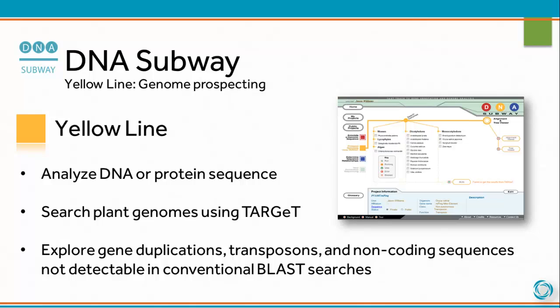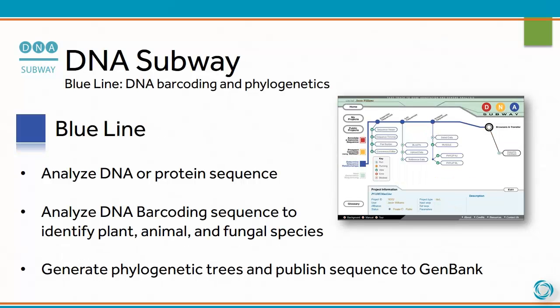The yellow line also covers non-coding sequences not detectable in conventional BLAST searches. The blue line is for DNA barcoding and phylogenetics. Use the blue line to analyze DNA or protein sequence, identify plant, animal, and fungal species using DNA barcode sequences, generate phylogenetic trees, and publish sequence to GenBank.